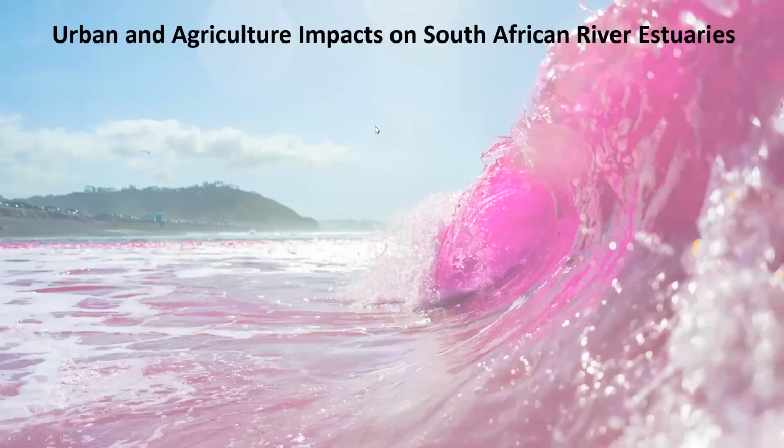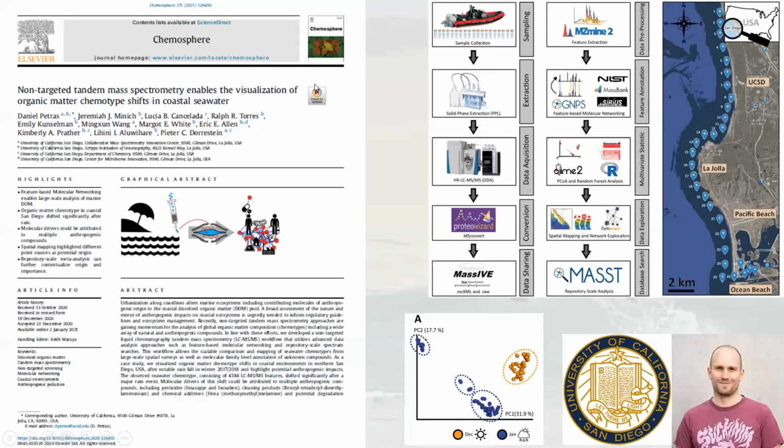All right. And now we can get to the actual part of the DOM analysis. So basically how this work started off was actually inspired by work done by Daniel Petras a couple of years ago in 2017 and 2018. He collected samples along the San Diego coast and into the San Diego River mouth and into the San Diego Marina, and then analyzed those using tandem LC-MS. He did this collection at two different time points, once before a rain event and once after a rain event. And what he found is that before the rain event and after the rain event, the LC-MS data was able to distinguish between the time points, which was not so surprising.